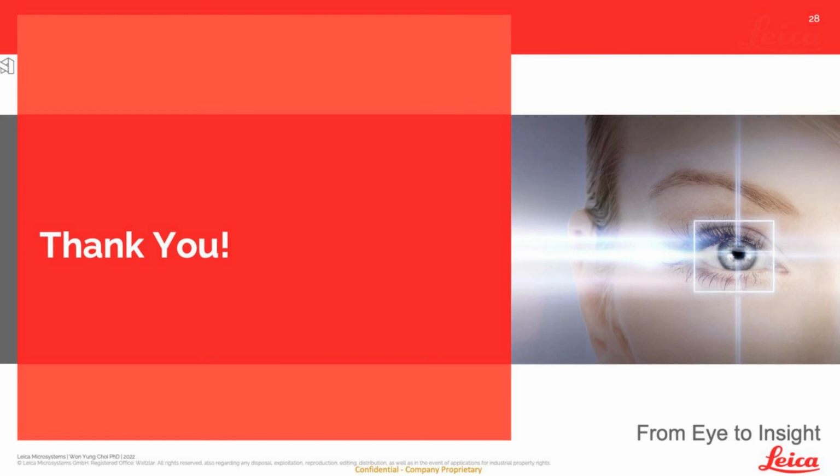Our first question here asks, can the new workflow handle 2D and 3D? Wanyang, it looks like you are still muted there. Hello, Kaylee. How are you? Thank you for that question. Based on our initial pilot studies, we are fairly confident we can handle both 2D and 3D applications with our workflow.